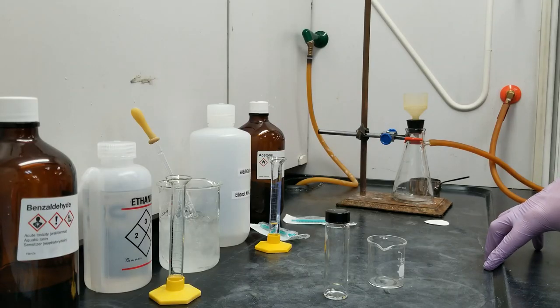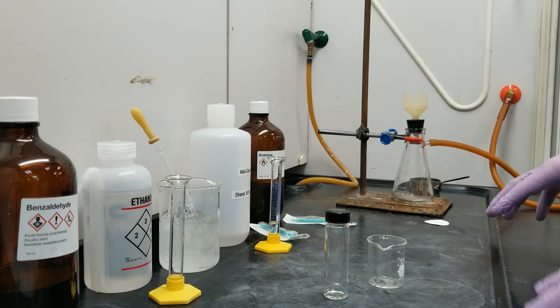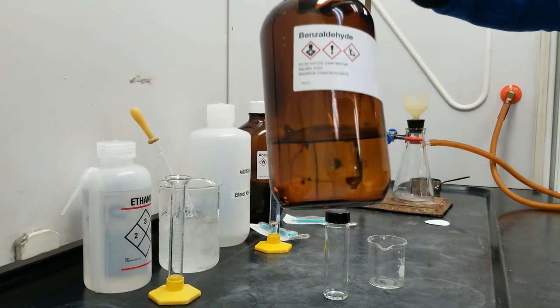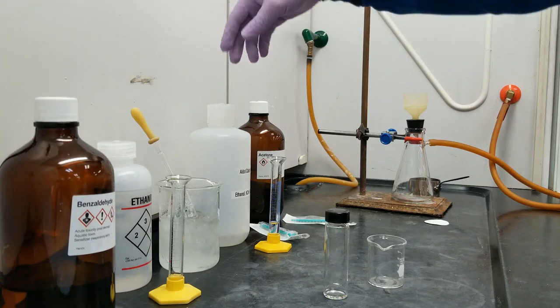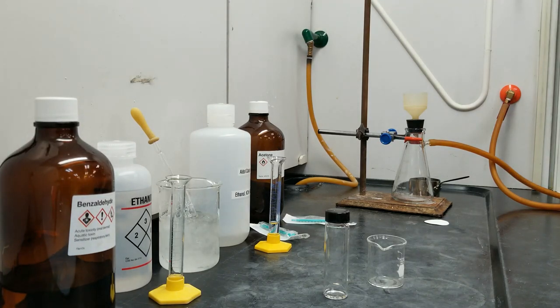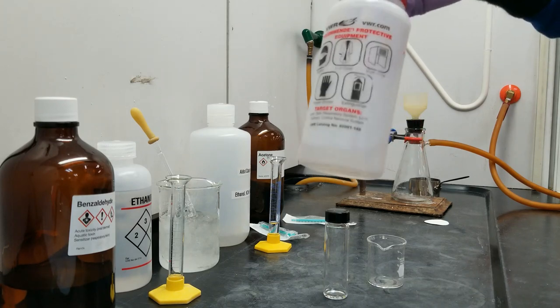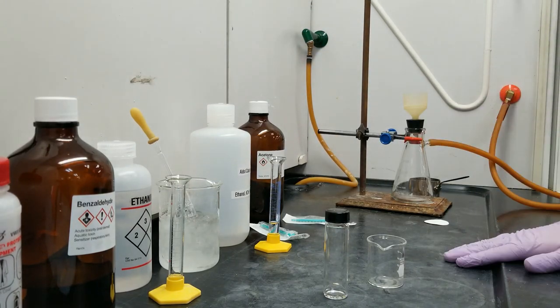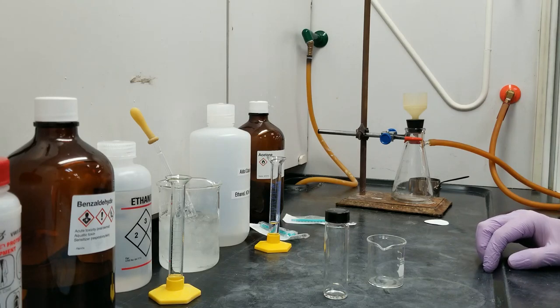Hello everyone, today we're going to be doing lab 6, which is the aldol condensation. The reaction we're going to do is combine benzaldehyde as well as acetone — which is the exact same thing we just cleaned everything with. We're going to do the only 2-to-1 reaction in the entire course, so pay attention to that when you're calculating your percent yields.